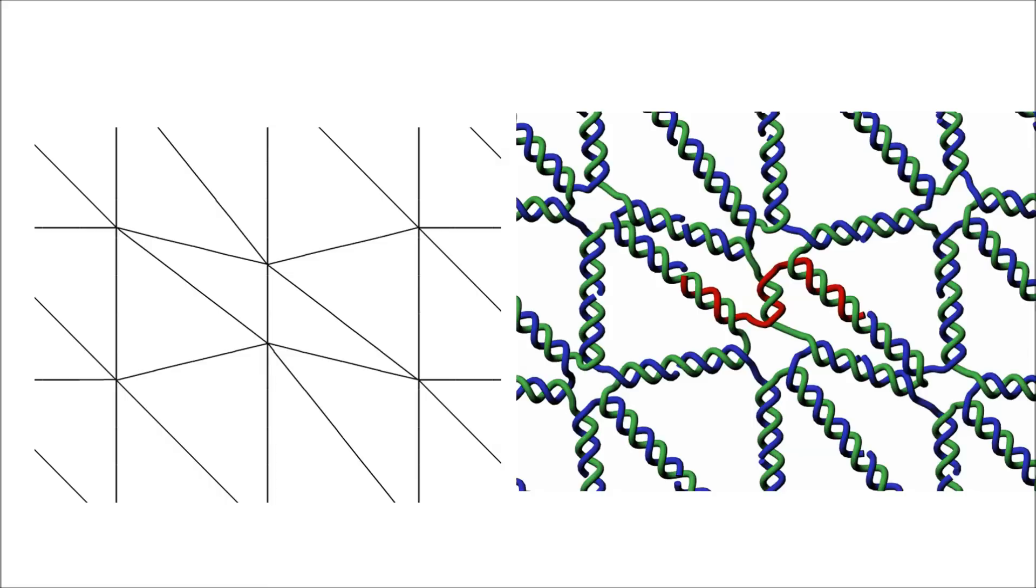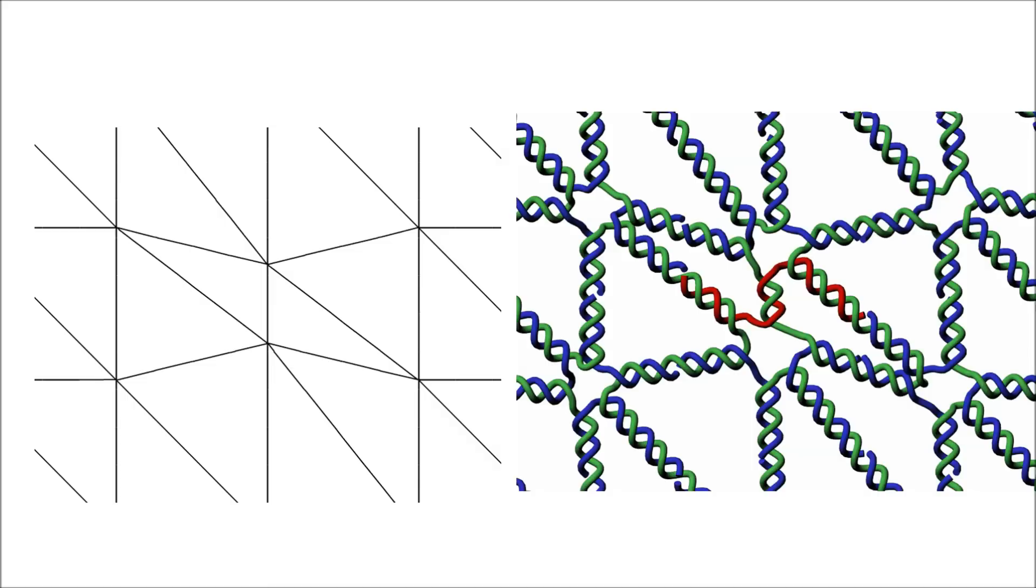I have to say, the downside of connecting multiple staples is the risk of creating kinetic traps, and that the cost of oligonucleotide synthesis will increase with length. So for complex meshes, we have to find a balance. In this tutorial, I will show you how to manually modify staple breakpoints, and also how to control the automatic staple generation in V-Helix.